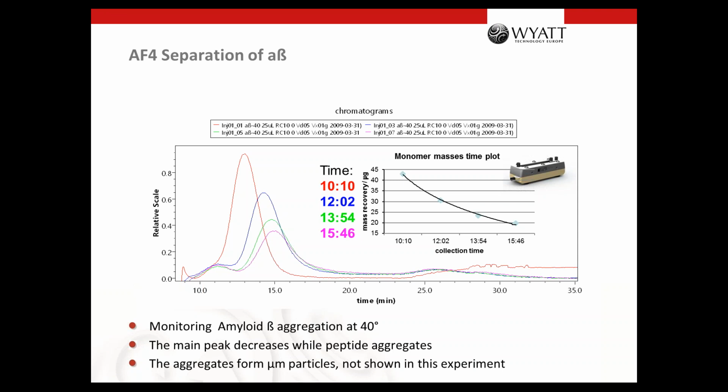It's difficult, just because of the cutoff of the membrane. You have to try that, because the PDI is very high with 2.5. I think there's a lot of very small material, smaller than 2 kilodalton, and then you have only one membrane you can choose, and the sample has to work with this membrane. So that's something you definitely have to try. I cannot say yes, it works, or it works not. You definitely have to try that.